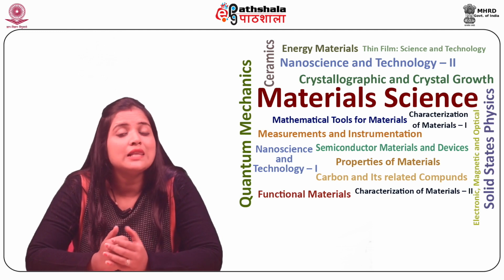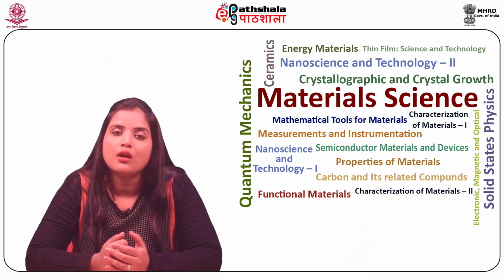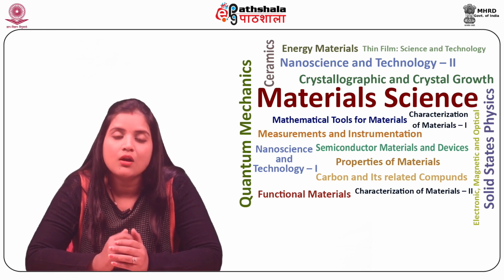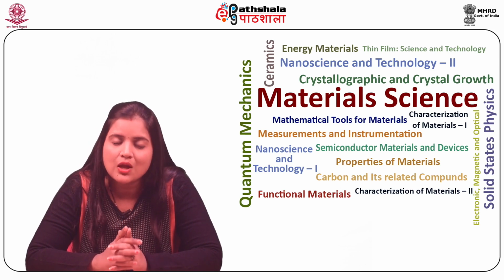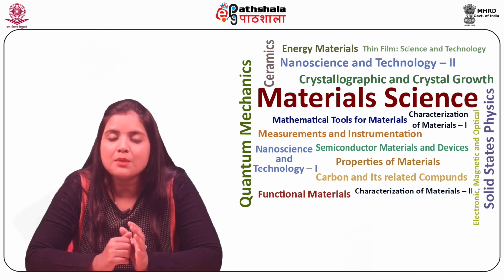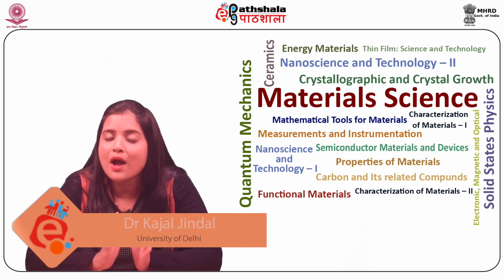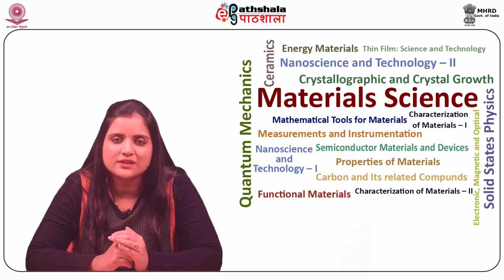So students, let us now summarize what we have learned in this module. In this module, the concept of digital holographic microscopy was introduced. Then, the working principle of digital holographic microscopy was discussed. The primary problems in signal processing in a holographic display were discussed. Finally, the advantages and applications of DHM were studied.